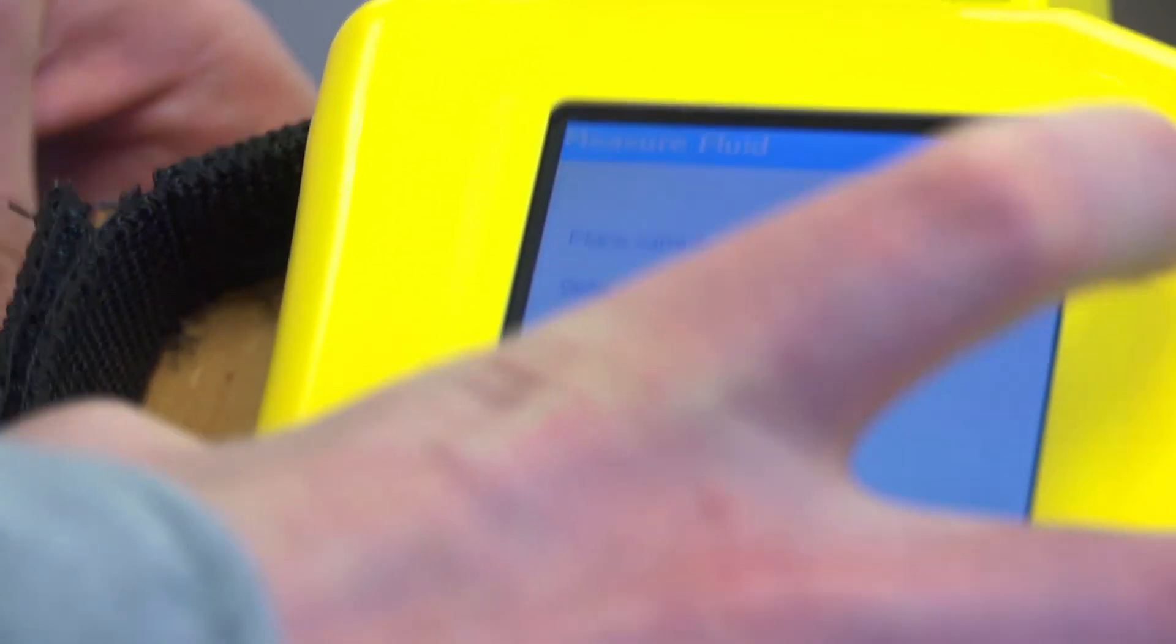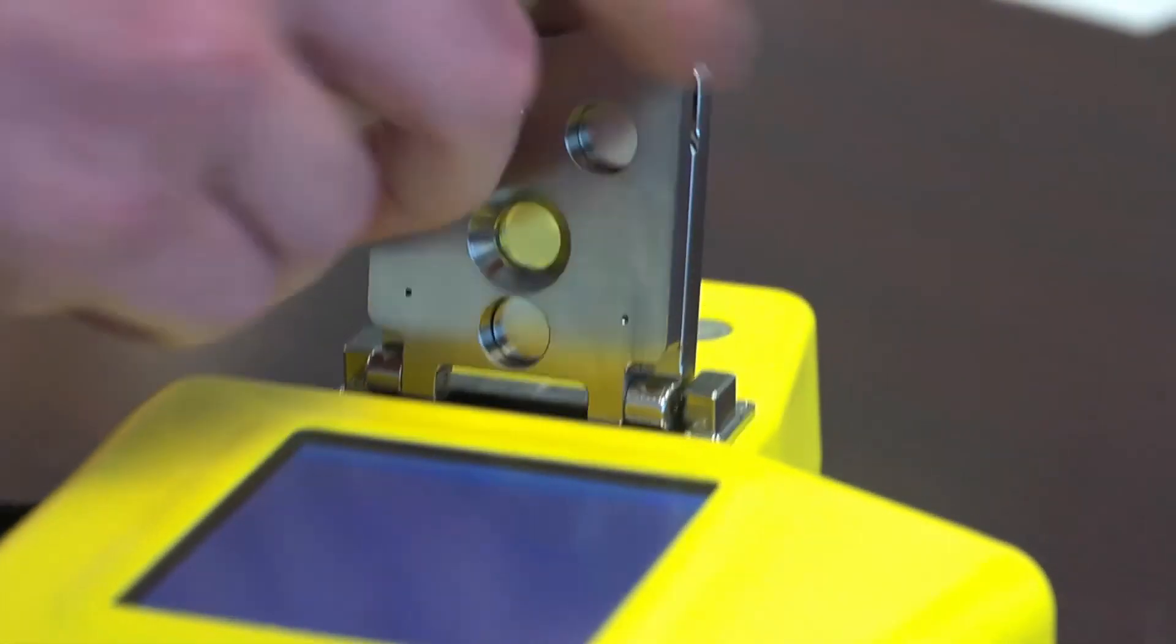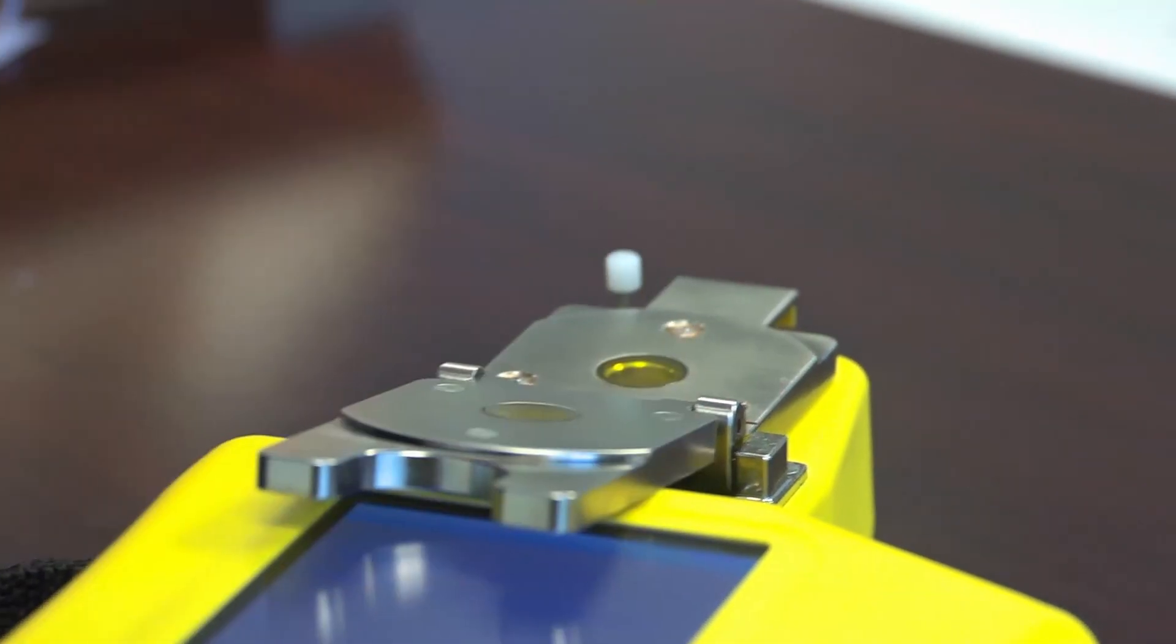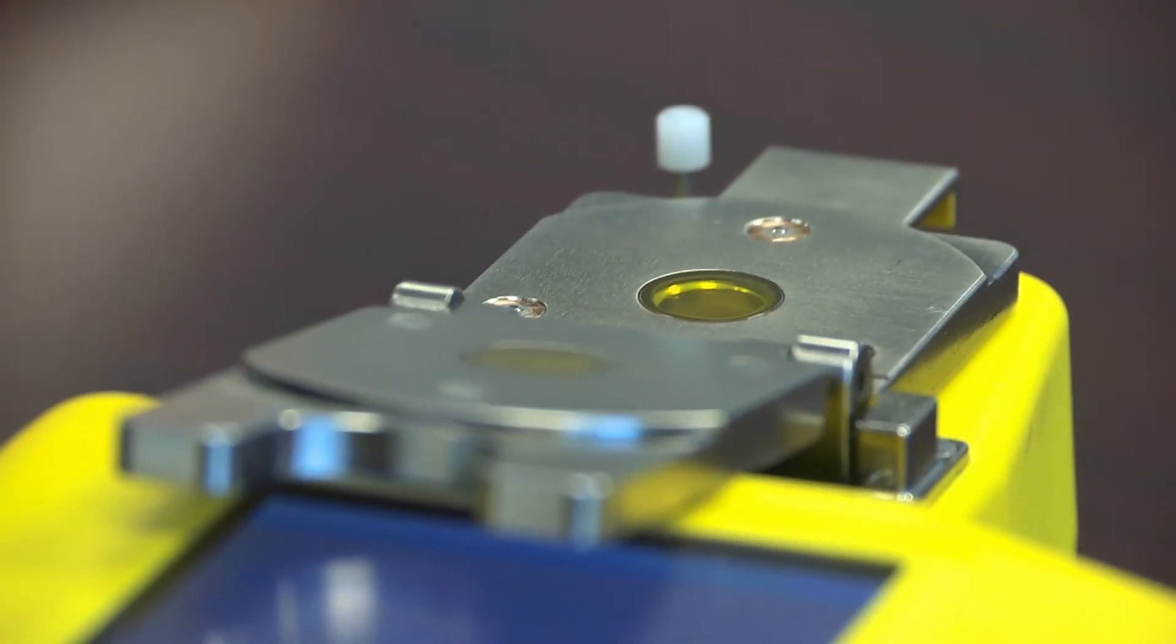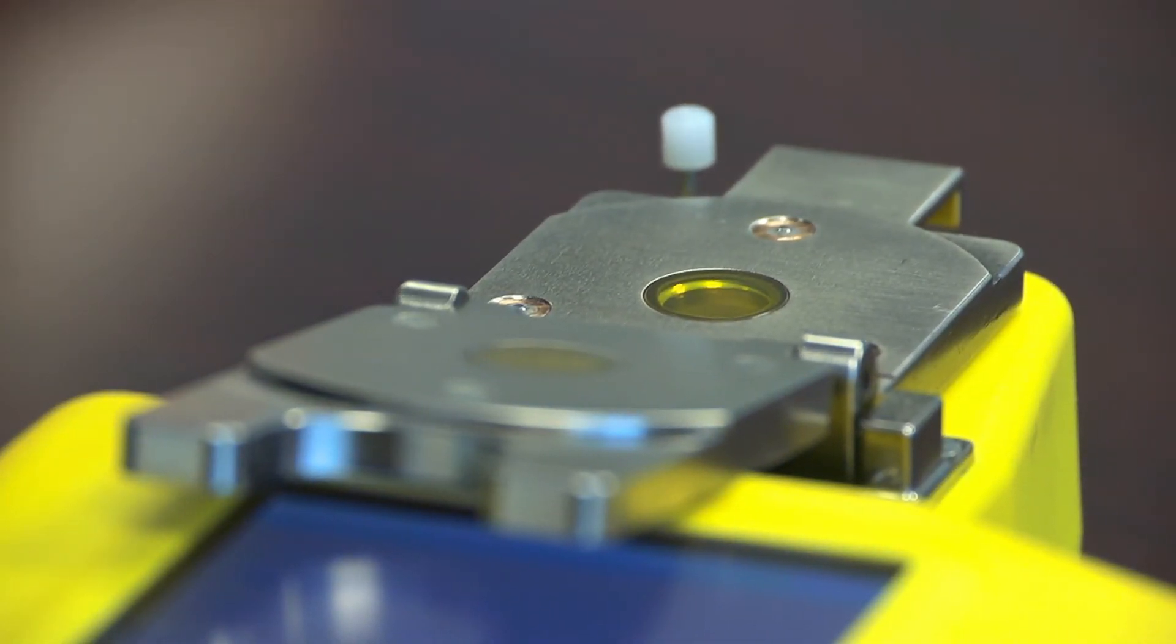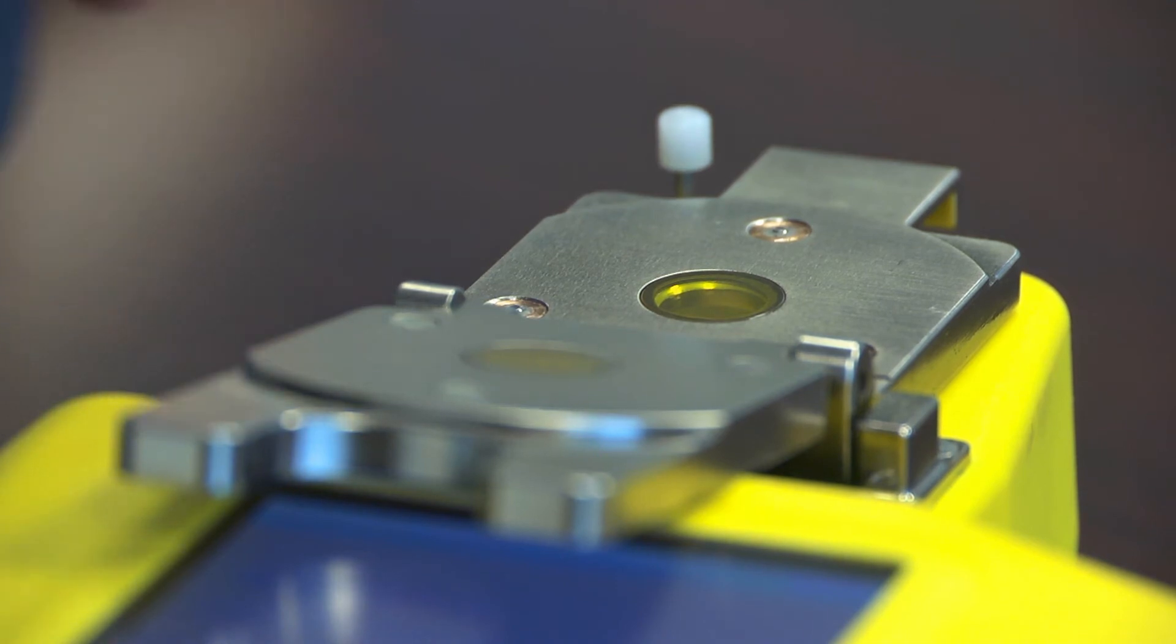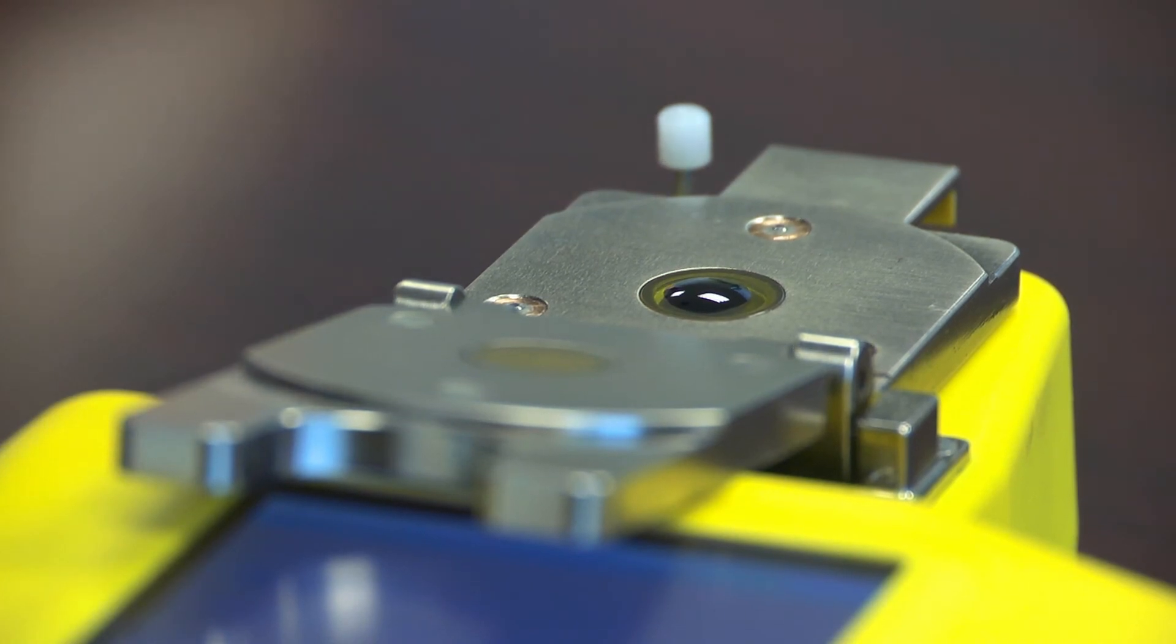Then it will ask you to place a sample on the cell. We open up the flip top cell and put in a small drop. A pipette is not necessarily necessary. You can use a dip stick or anything else. Just enough to cover it when you close.